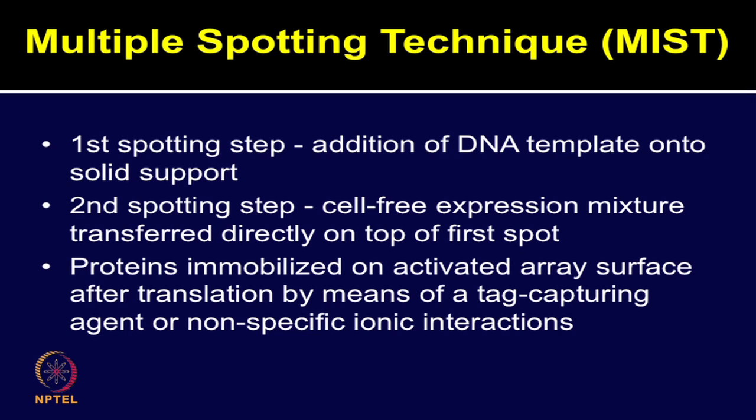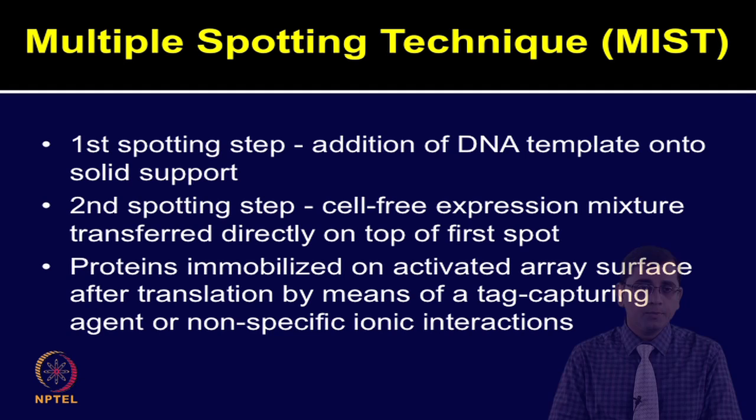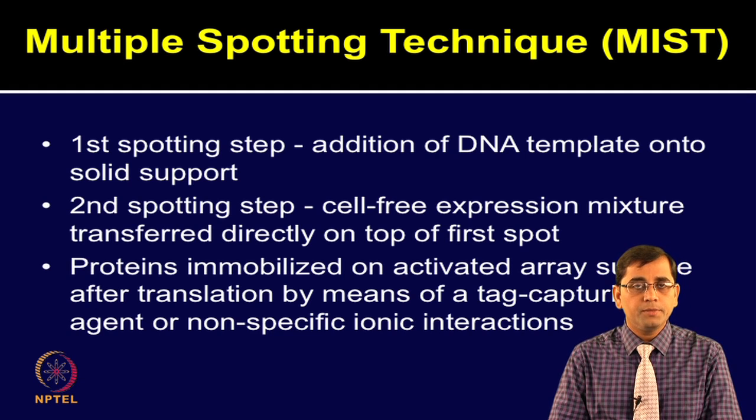In the first spotting step, DNA template is added to the microarray solid support, and during the second spotting, the cell-free expression mixture is transferred directly on top of the first spot which contains DNA.